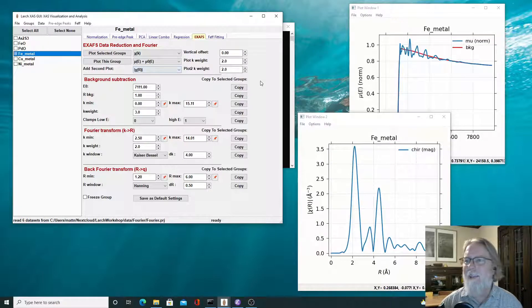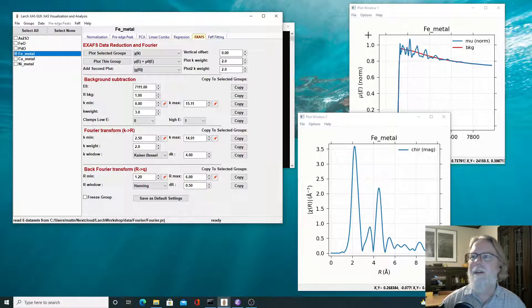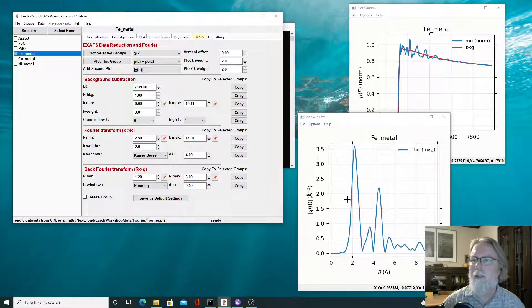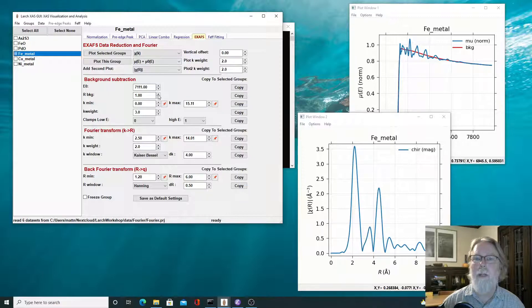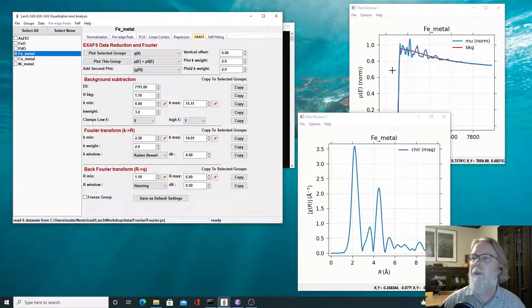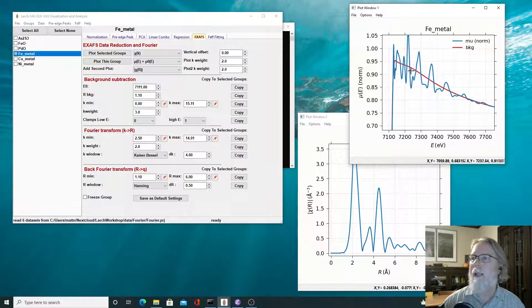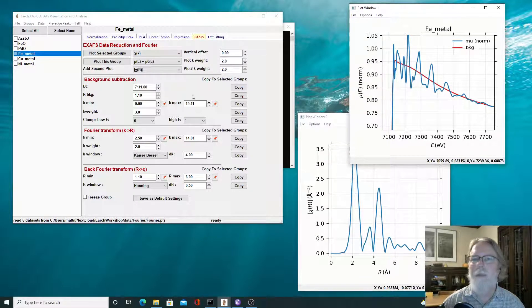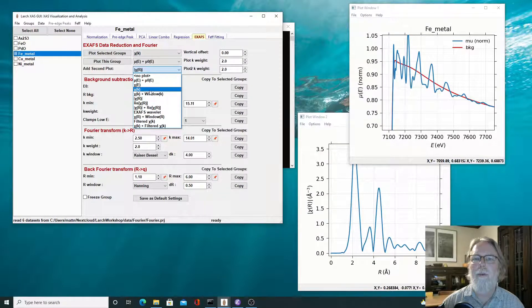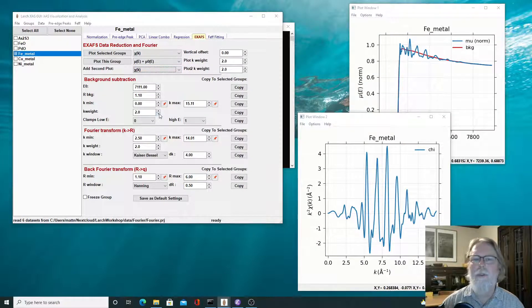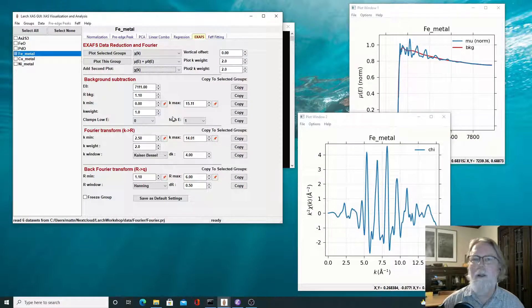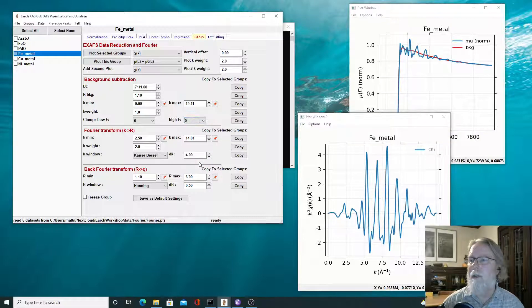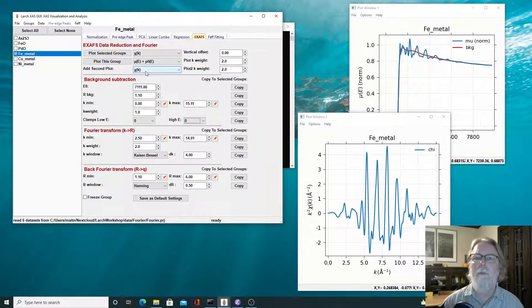If we look at, so the rest of the data sets here, so that's two transition metal oxides and the sulfide, which probably account for most of the data that's actually interpreted. So for metals, it can actually be a little, both easier and harder, because the first neighbor distance will be longer in most metal systems. So it can be a little easier because you can pick an RBKG that's clearly bigger than one and still get a good result. So for here, for iron foil, for iron metal, a very smooth background does a good job. And there's kind of K, and that was a K weight of two and three, and K weight of one maybe isn't beautiful. You can try K weight of zero. Sometimes that helps actually for some data, and you can play with the weighting factor too.